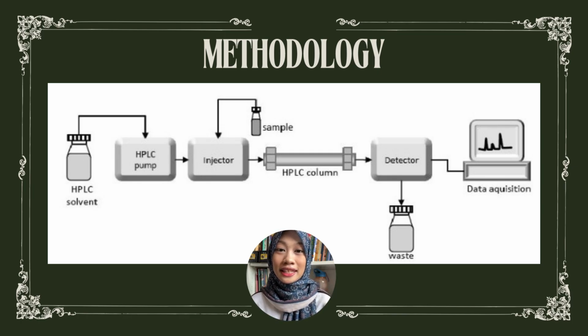For the methodology, this is a block diagram of the HPLC system. The HPLC system consists of solvent reservoir, pump, injector, column, detector, data acquisition system, and waste bottle, all working together to separate, detect, and analyze sample components efficiently.